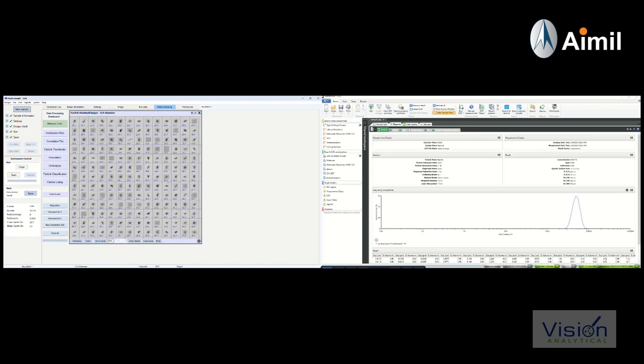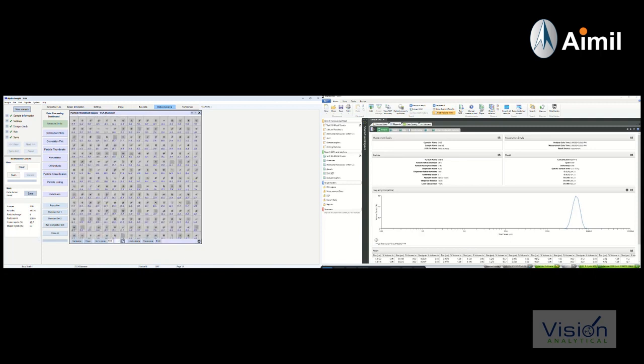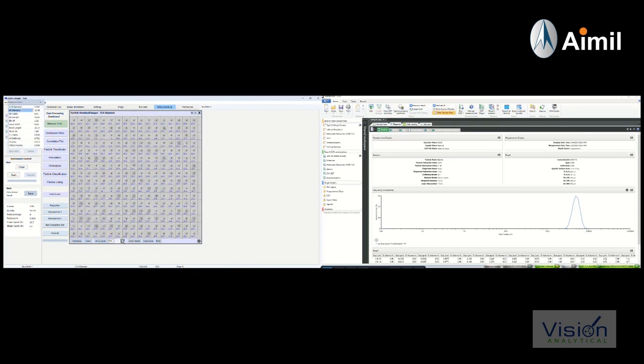The fact that we actually had small particles and they were not seen by laser diffraction doesn't necessarily mean that they're not there. This is why image analysis is a good complement to laser diffraction. With respect to the application that we're working on here, the vast amount of small particles is what was causing the rheological differences in the fracking material in the proppants.